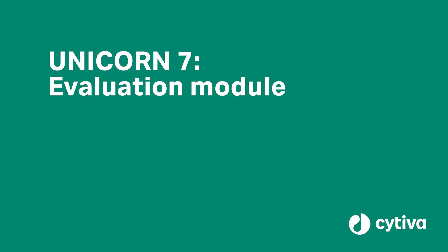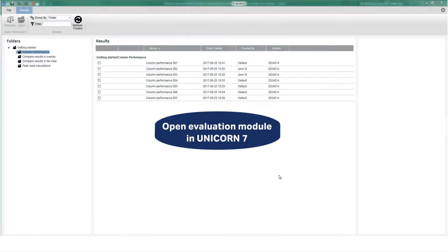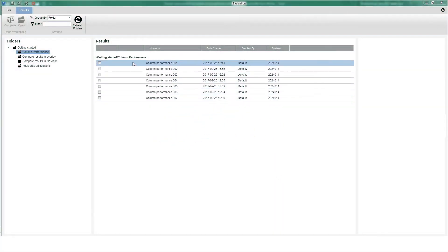Track the performance of your column with Unicorn 7 to ensure continued quality. Start by accessing your results in the browser.